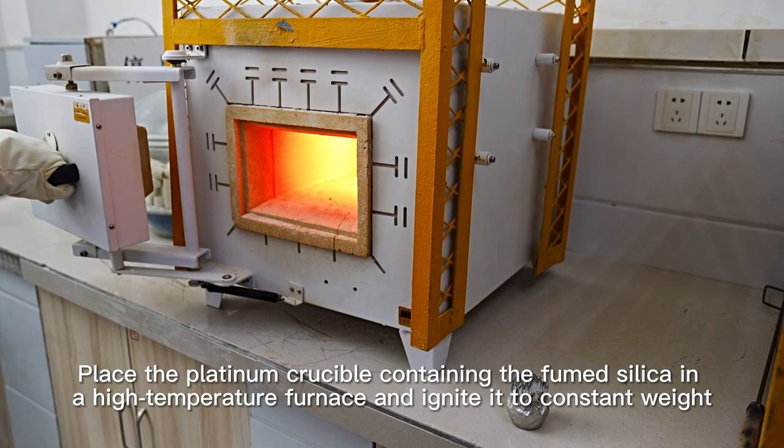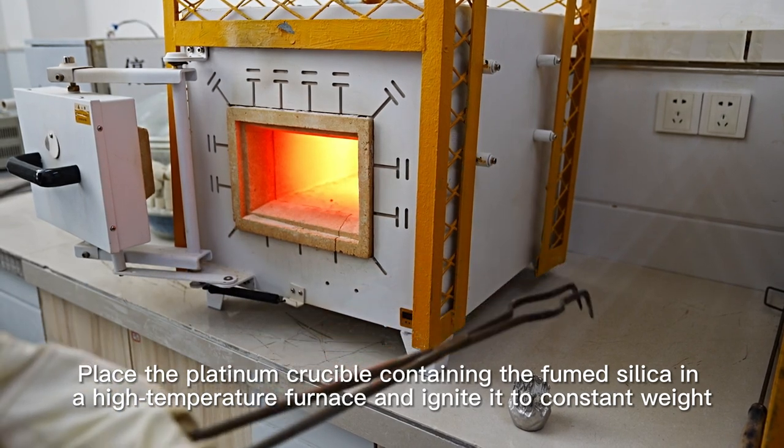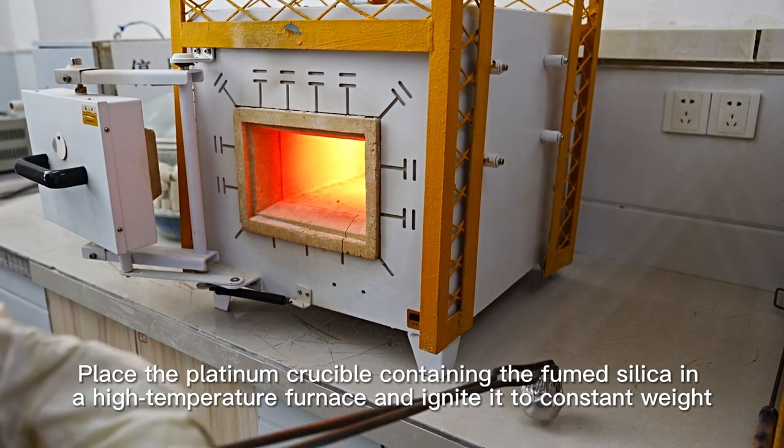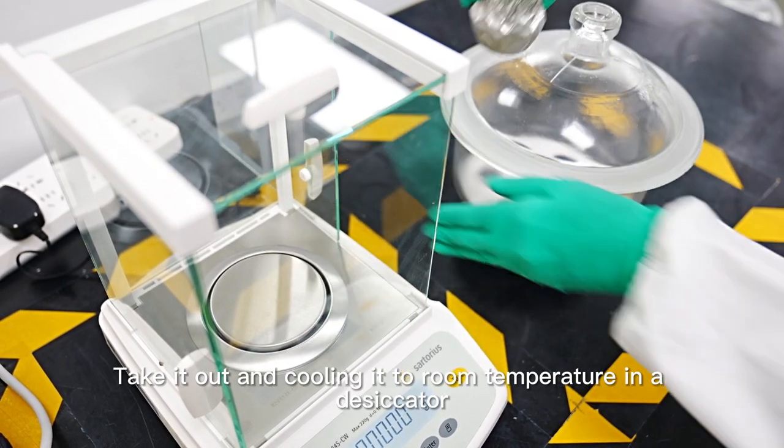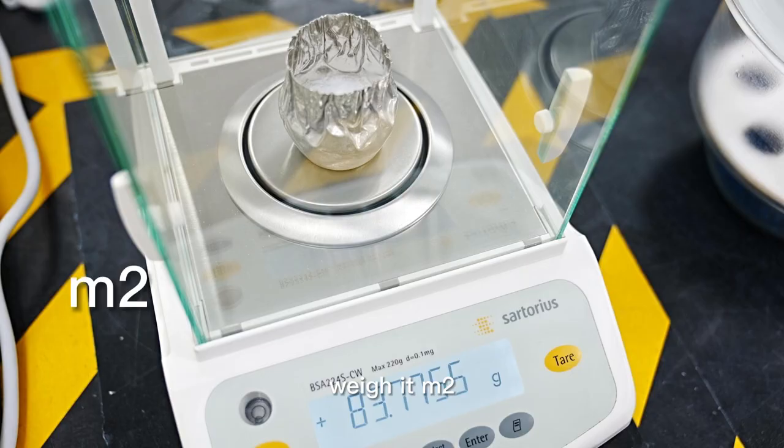Place the platinum crucible containing the fumed silica in a high-temperature furnace and ignite it to constant weight. Take it out and cool it to room temperature in a desiccator. Weigh it M2.